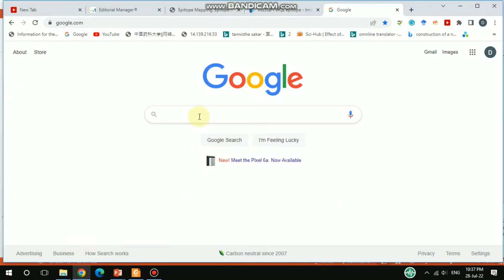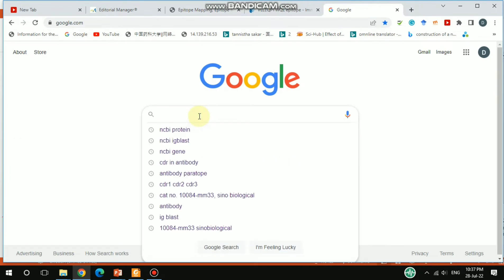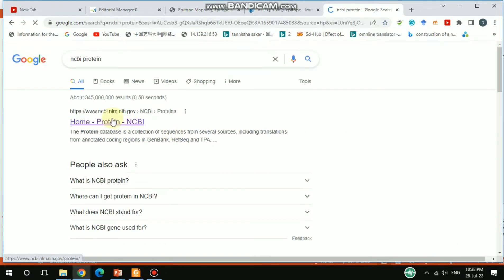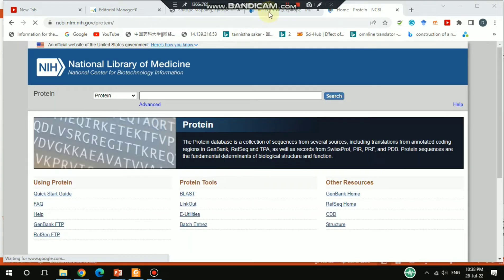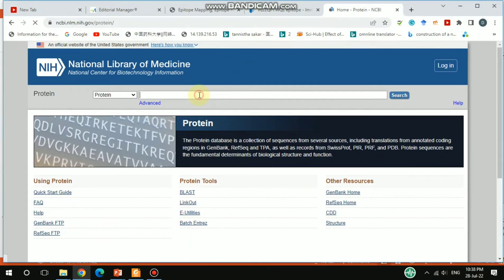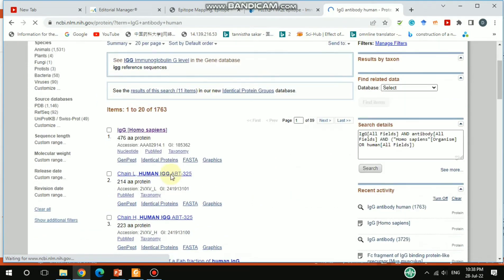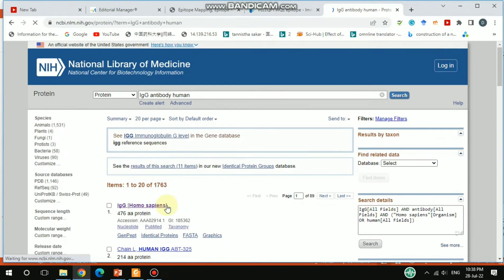To get the detailed sequence, you have to go to the NCBI Protein database. Type 'IgG antibody human' and you'll get IgG from Homo sapiens. You can click on that entry.